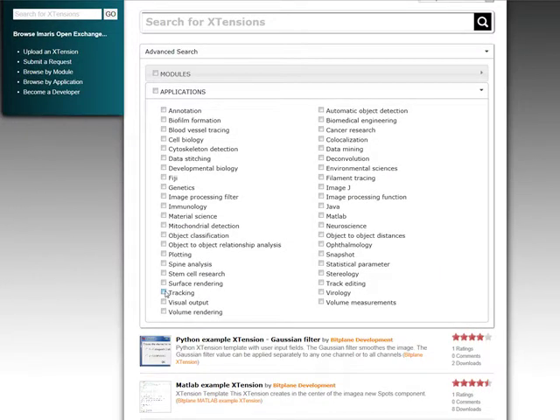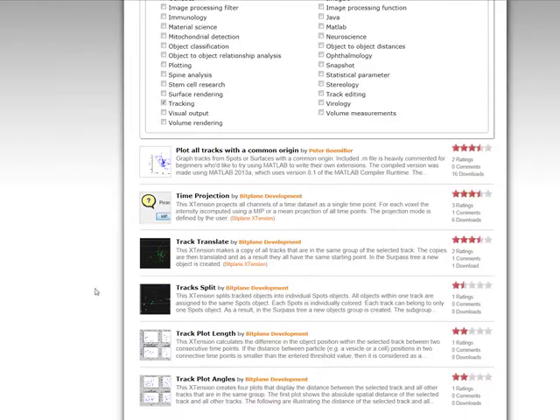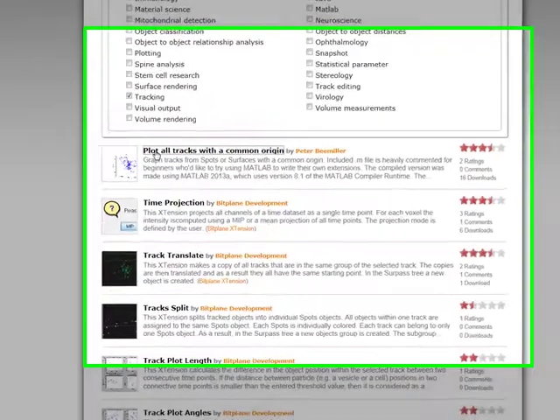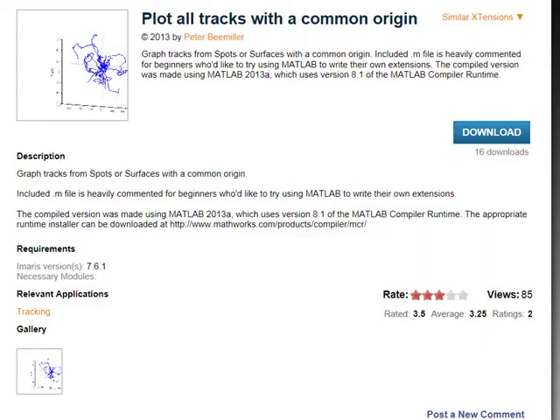To find out more about a particular extension, just click on its name. The page with the extension description is opened. There, you can find more information on the system requirements, possible applications, as well as a screenshot that illustrates the extension results.